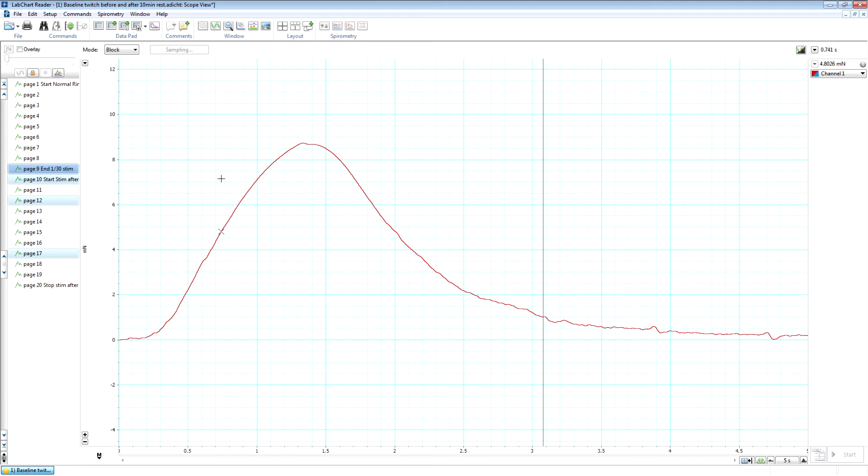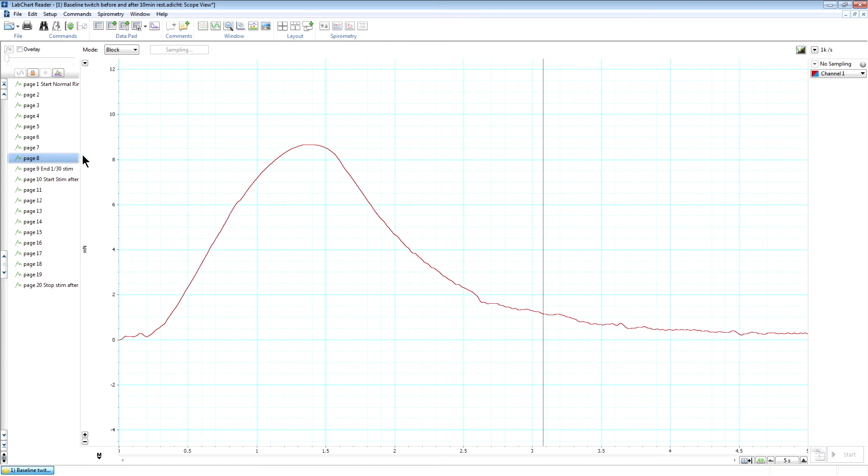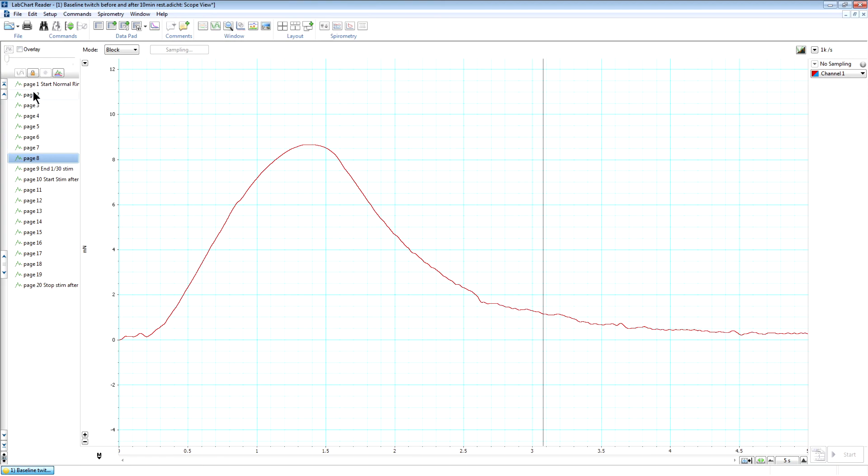I've labeled all the pages on the data files as we recorded them in the left-hand column with information about what's going on during the experiment. So ordinarily, when you look at all these curves, they're just all these blue curves and you've got no way at all of telling what's been going on during that particular recording. So you need these labels in order to tell where the drug treatments are going on, where frequencies changed and all that sort of stuff. So I've put those labels in here.